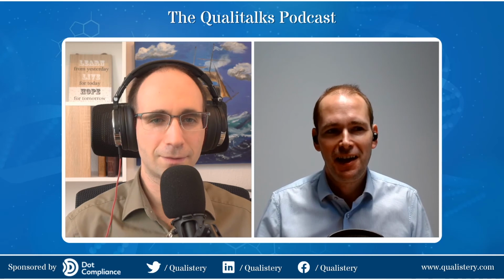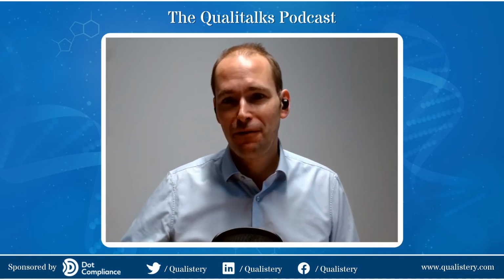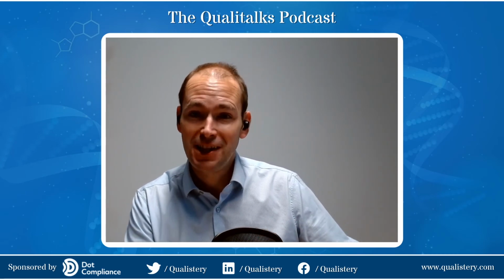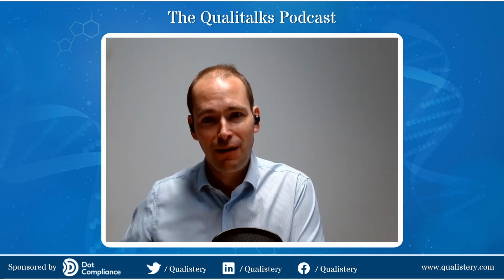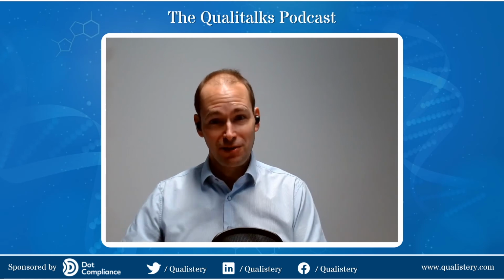And again, your production has a big step back, and you again lose money. Is there anything else? Yeah, I guess when we're looking at that, if we do have a production failure and it's a regular failure, it's an awful lot of time. Your machine can be out for a week without being able to use it at all, and that could happen fairly regularly. And it's all about, first of all, with the URS, ensuring that doesn't happen, and that we're aware at the URS stage that we can put something in there to prevent it from happening, or if it does happen, to help resolve it.